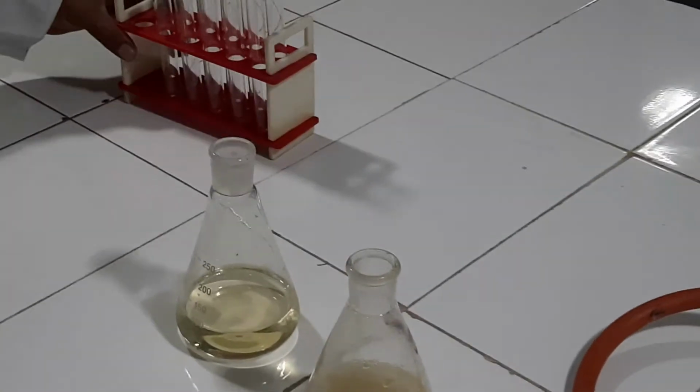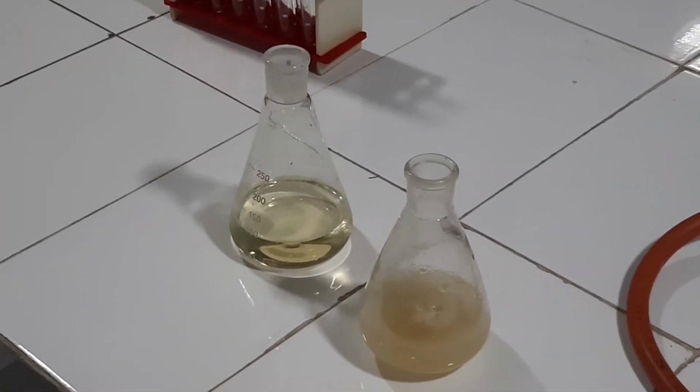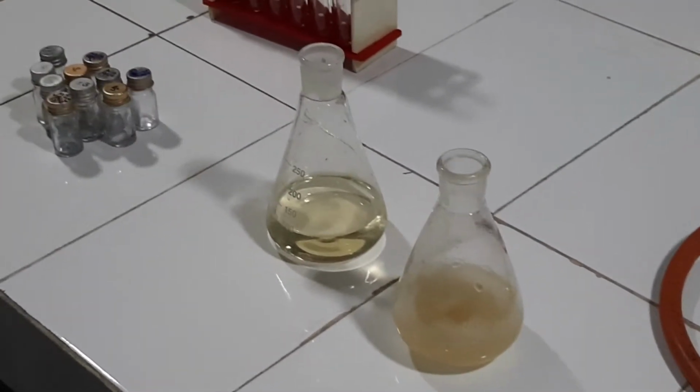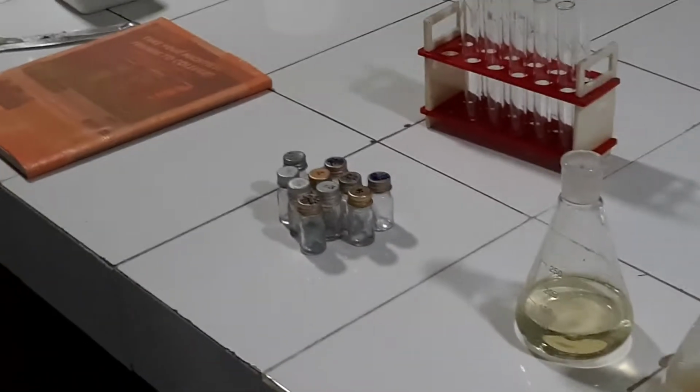And this liquid media will be poured into test tubes. Solid media will be poured into these bottles or petri dishes.